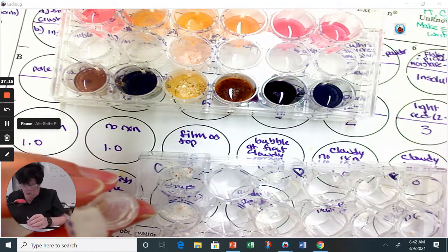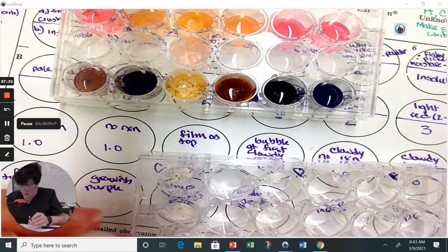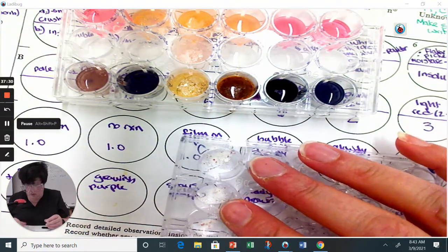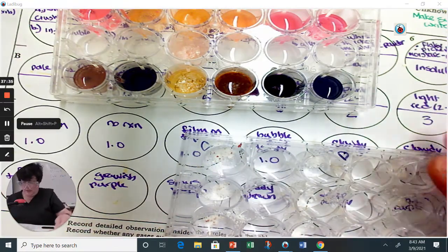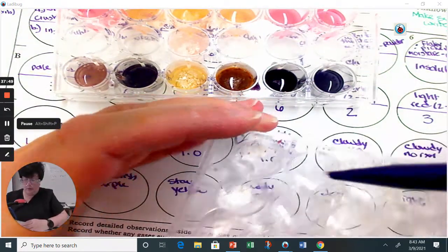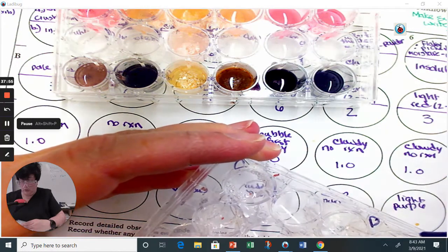So A was chunky. C had that outer coating that's pink. And D was very powdery, and F was very powdery. Let's look at their solubility. Again, I'm just going to pour, and then we'll stir over the black paper. So I'm going to squirt water into the 2 cells, the first 2, so I can do pH.